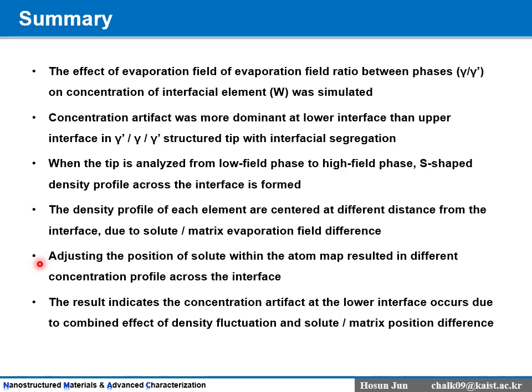Adjusting the position of solute atoms resulted in different concentration profiles, and this result indicates that the concentration artifact observed in the lower interface of the APT data is caused by the combined effect of density artifact and solute matrix position difference.